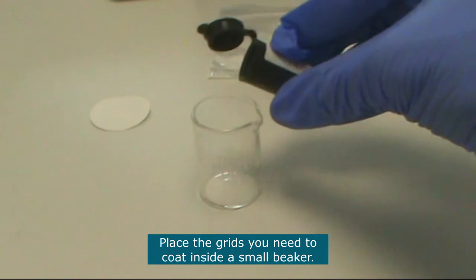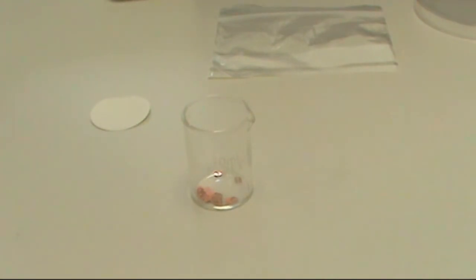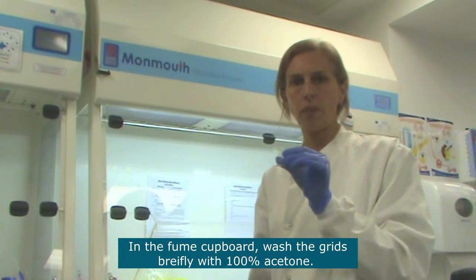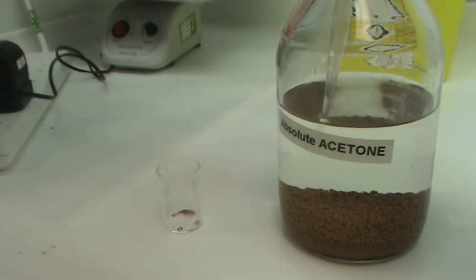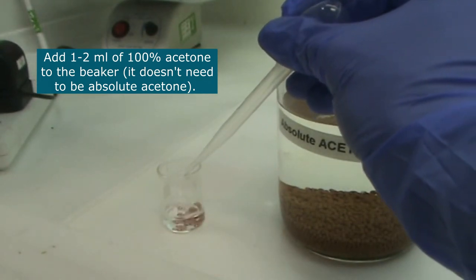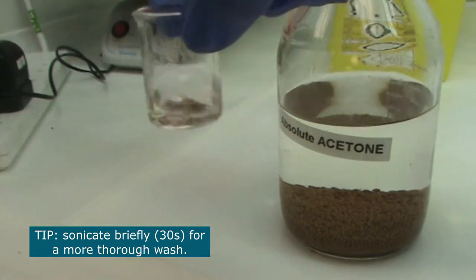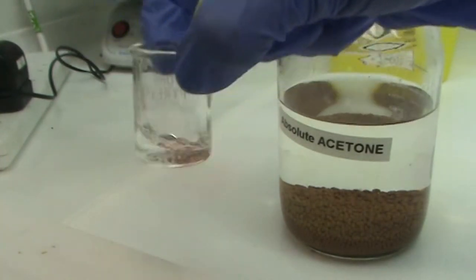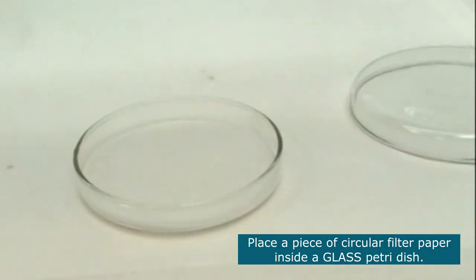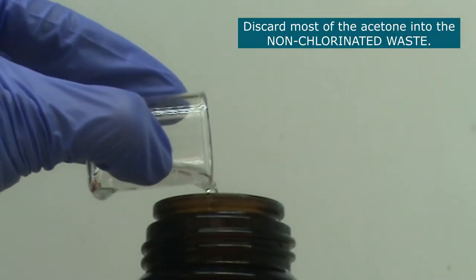So place the grids you need to use inside a small beaker. Now, working in the fume hood, wash the grids briefly with 100% acetone. Take a glass petri dish and place a circular piece of filter paper inside. Discard most of the acetone into the chemical waste.